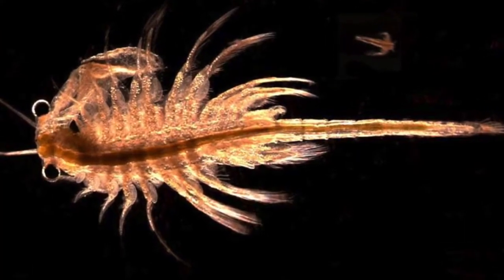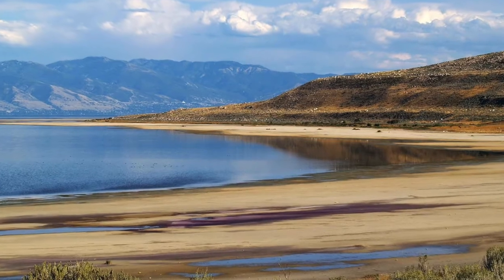We're going to start with our brine shrimp lab. Brine shrimp are one of the most adaptable animals on planet Earth, and we know that they hatch in the Great Salt Lake in Utah, so we know that they require salt.